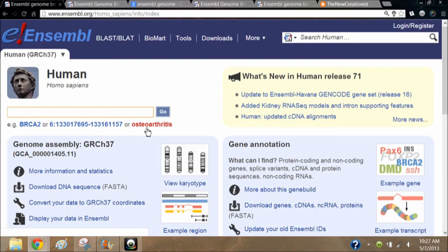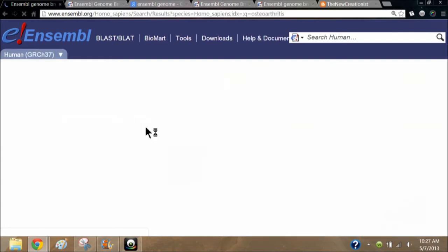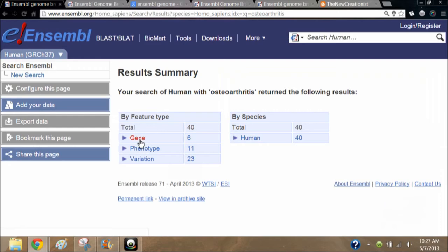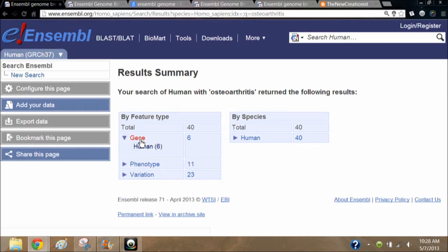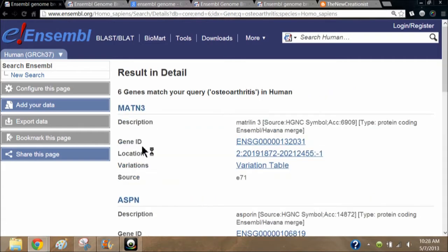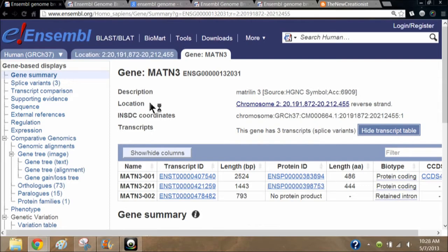For the purpose of this video we're just going to click on what's here as an example: osteoarthritis. That's going to give us a list of the genes associated with this particular condition. Since we're here to do gene comparisons we're going to click on 'gene,' and since we're already on the human section we'll click human. That gives us six genes associated with osteoarthritis, and we're just going to click on the first one, which is Matrilin 3.